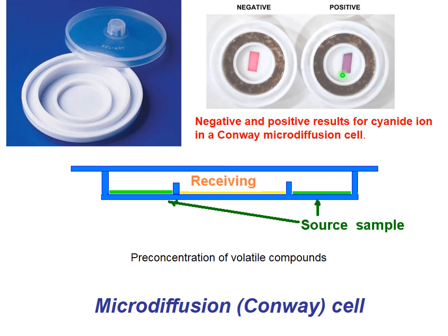Ammonia, hydrogen chloride, all halogenides, chlorine, bromine, iodine, alcohols, acetone, and lower ketones, aldehydes. All of them can produce volatile compounds, can be easily detected. Carbon monoxide, another example. Very simple, very inexpensive, very reliable procedure.